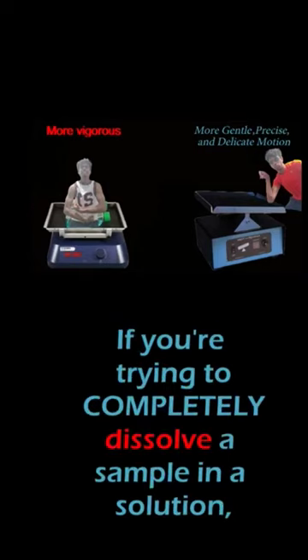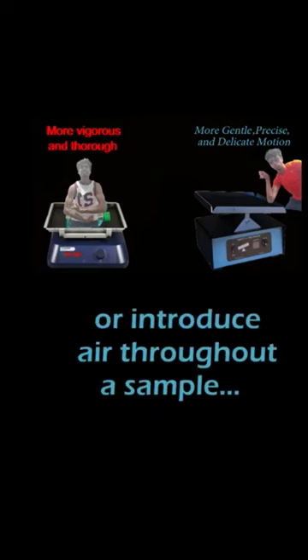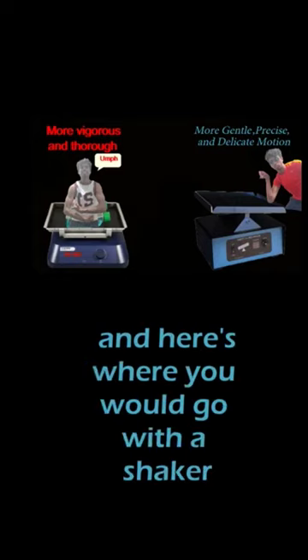If you're trying to completely dissolve a sample in a solution, thoroughly distribute a mix of two reagents, or introduce air throughout a sample, you need a mixing motion with a bit more oomph to really ensure that everything gets mixed around thoroughly. And here's where you would go with the shaker.